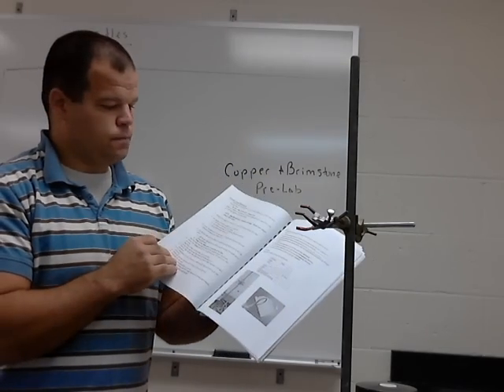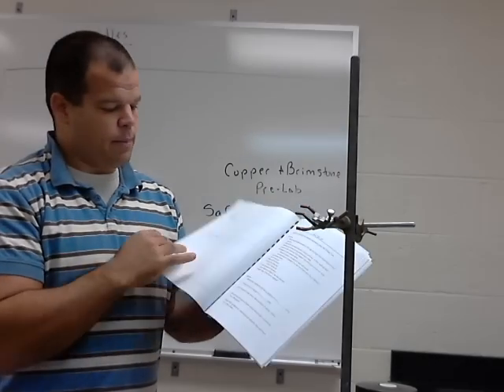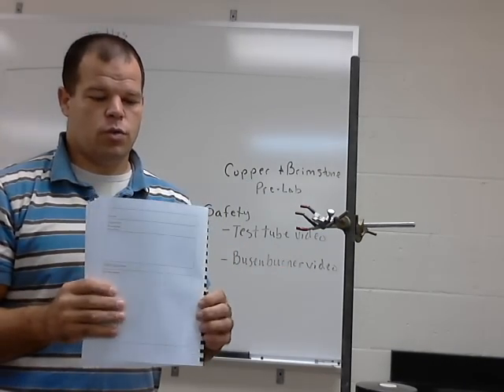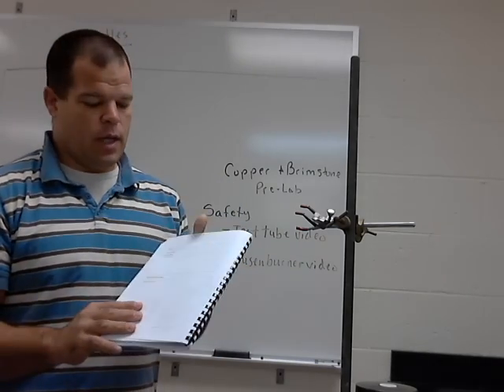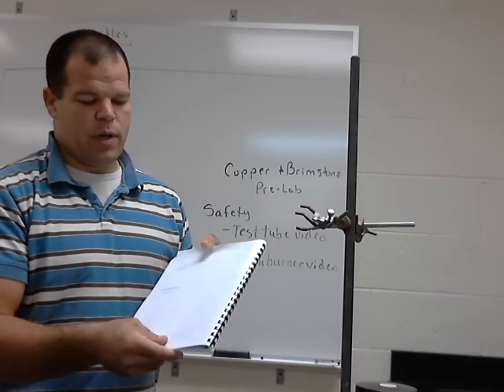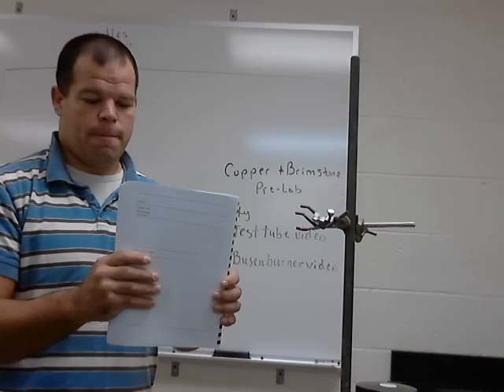But in this case, it gives sample data tables, has some questions here, the procedure, and then the back page is going to be a data collection page. Regardless of how things change, you'll always be recording data in lab, in hand. It has a title, has a procedure section, and it has a data section. The rest of it will be completed in an online format. This is what you will be working with in lab.